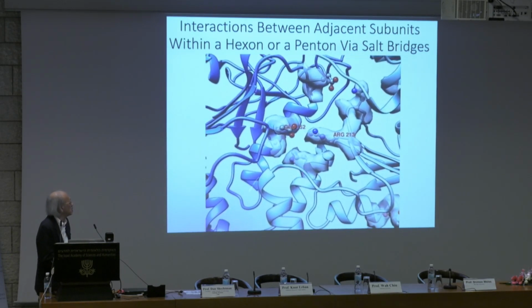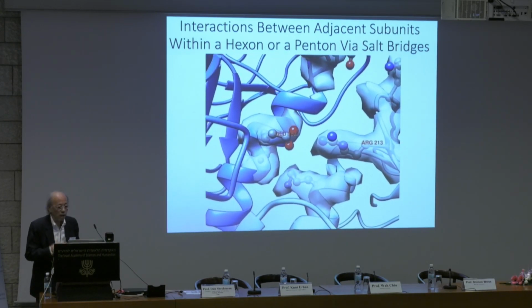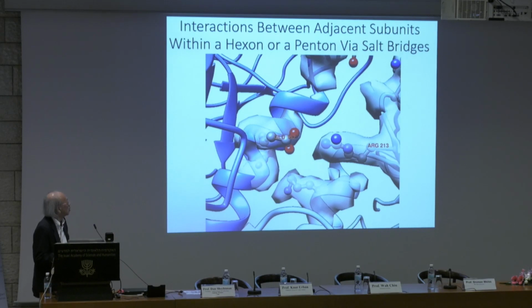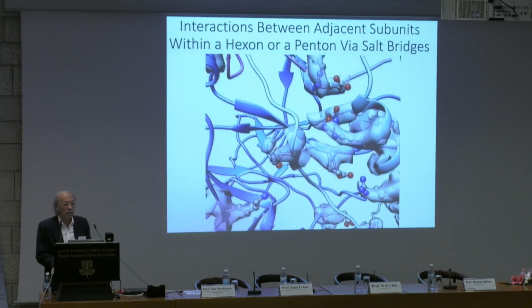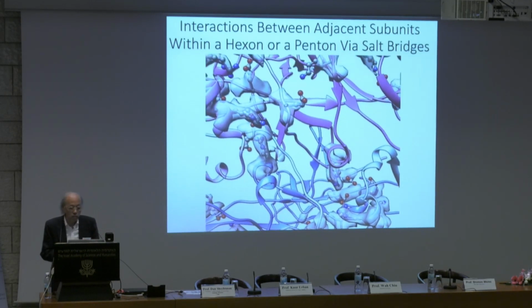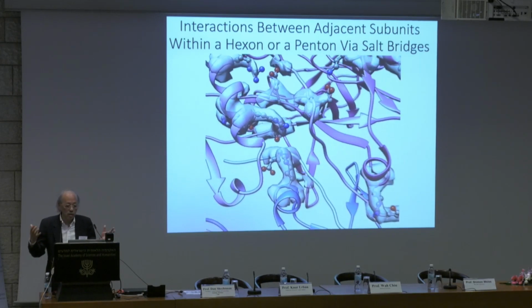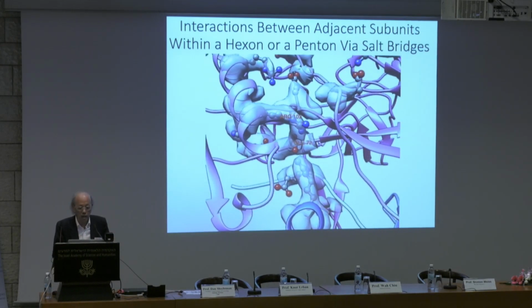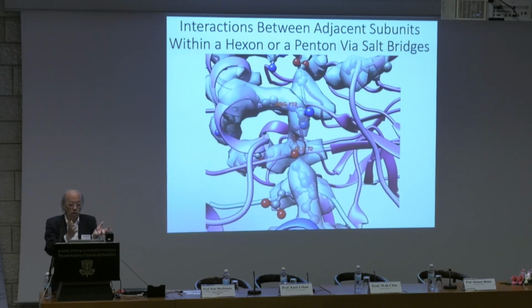In fact, in addition to hydrophobic interactions, as we heard from the talk by Dr. Whiteside earlier this week, there are lots of protein-protein interactions, and in here are the salt bridges we believe are important in maintaining the subunits within a hexon. So that is what we learned immediately from this kind of analysis with this 3.3 angstrom density map of this mature virus. Now, what I'm showing you is only the protein capsid shell.